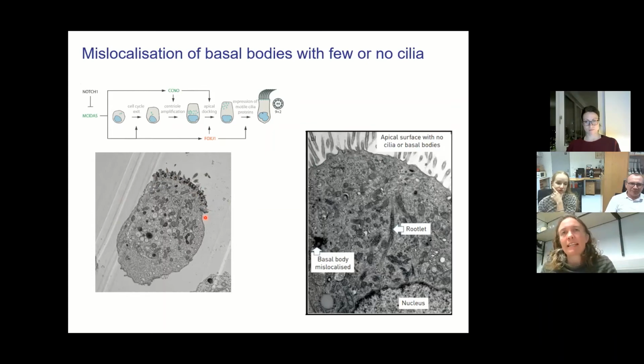But in these aplasia cases, or in these reduced generation of multiple motile cilia, you see a complete absence of these basal bodies at the surface. So you can see here, there's no basal bodies at the surface. You see occasional ones within the cell. You can see the ciliary rootlet, the striated rootlet that I was talking about earlier in the normal samples, but you don't see cilia forming, and that can help in the diagnosis as to trying to tease out what's primary and what's secondary.